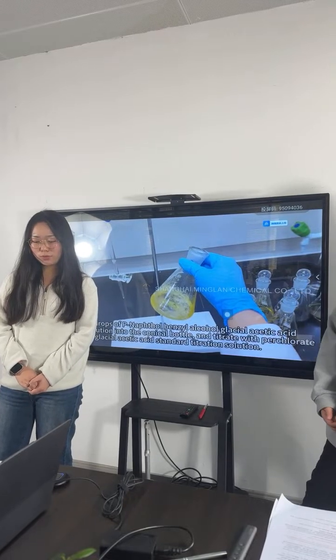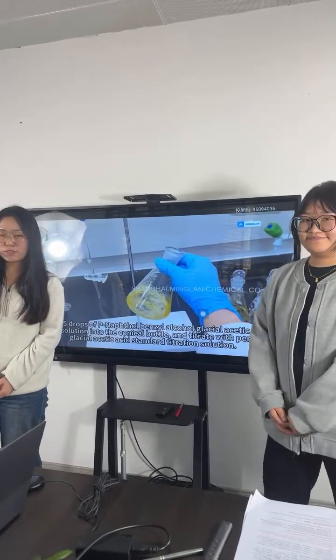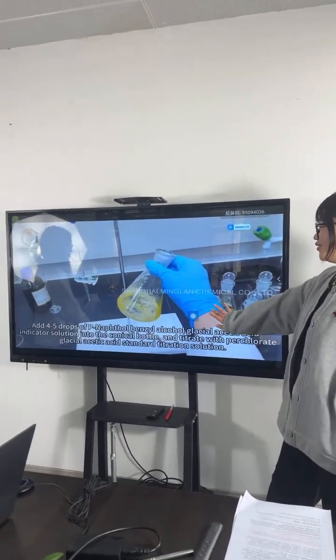And Winnie, can you tell us about the final result after adding the titration solvent? Okay.